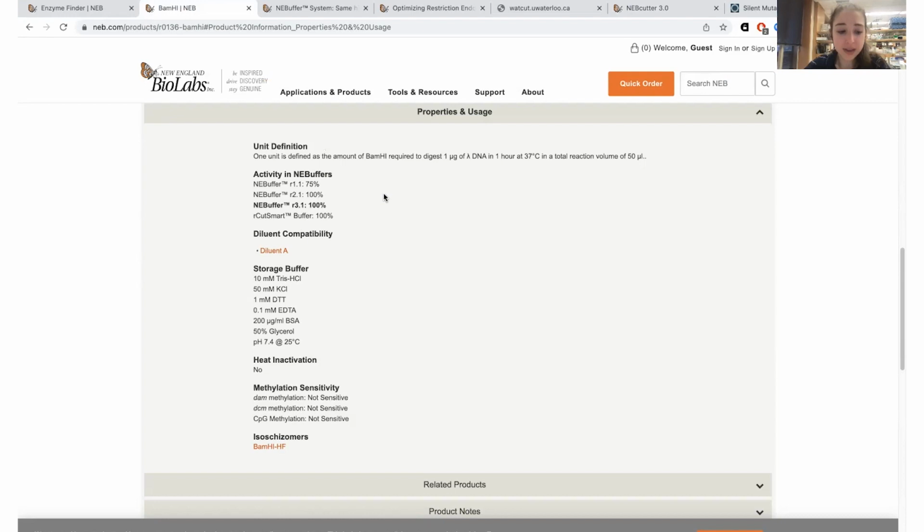You can think of it this way: if you have a bunch of stuff in the tube, some of it is going to stick to the sides, because some stuff always sticks to the sides of the tube. You want the stuff that's sticking to be the BSA and not your stuff. So if you put a bunch of BSA in there, now your stuff is less likely to stick.